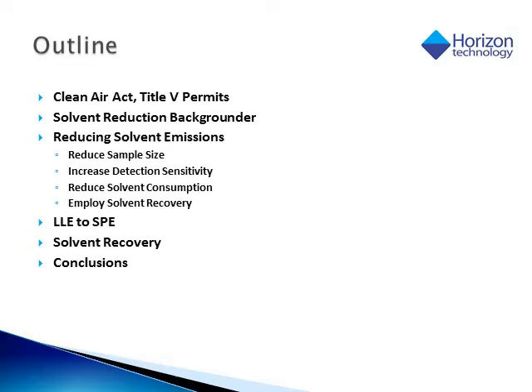The outline of this talk will cover the Clean Air Act with Title V permits, a background on solvent reduction, reducing solvent emissions by several approaches, discussion of the liquid extraction technique and then migrating over to solid phase extraction, means of solvent recovery, and then a review of the conclusions.